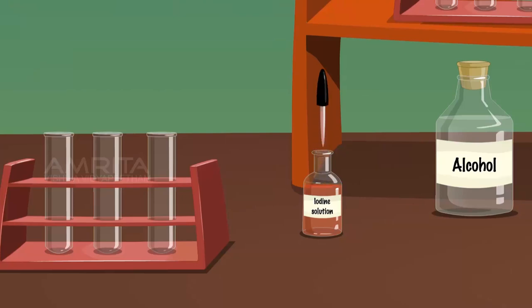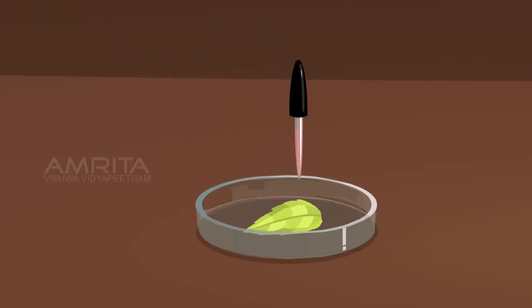Take iodine solution using a dropper. Drop a few drops of iodine solution on the leaf.